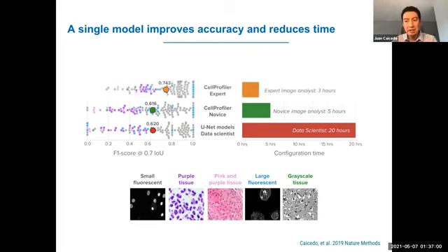If you ask an expert image analyst, they can optimize the parameters of segmentation algorithms much better because they have experience on what are the parameters that help me get the segmentations right. And they can get up to 74 percent accuracy, which is kind of interesting, in even less time. So having experience definitely helps.